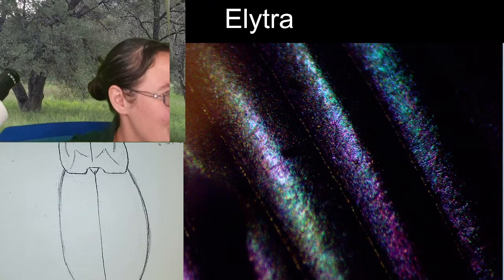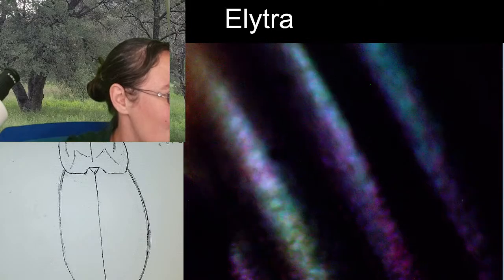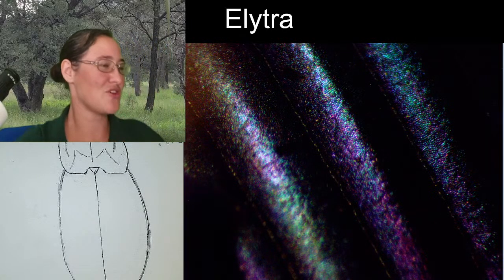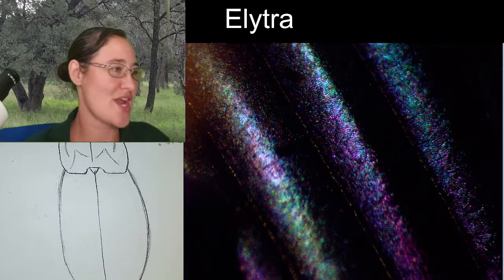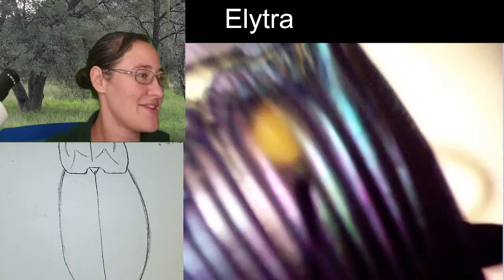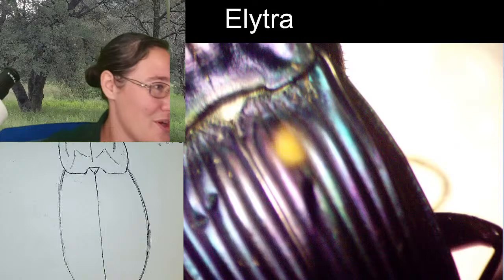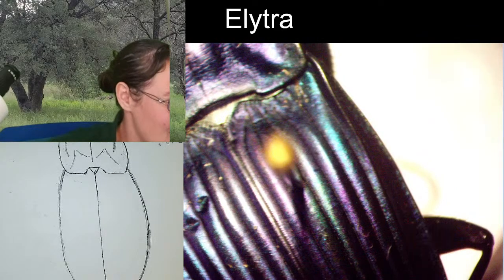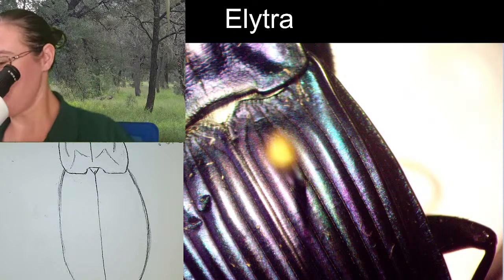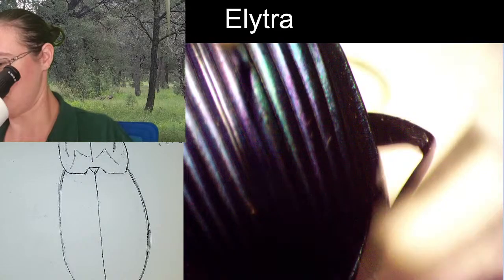I mean, look how cool. So, on the elytra, those dark regions, those are the striations, those are the stripes, and then you can see where the light's hitting and where it's not. They're so pretty. Okay, so now I'm going to go ahead and count some striations really quick.